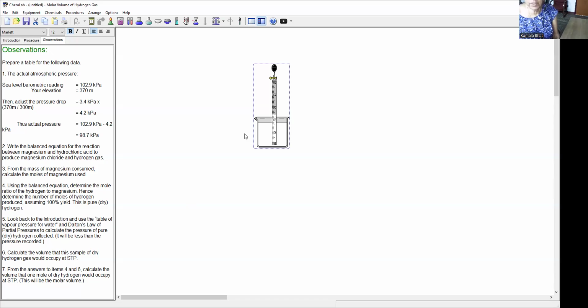Make sure to copy the picture of the experiment, initial and final, so that I can read the volume of the gas inside. Pressure is there, and complete it. And so complete the homework. Put your results, discussion, conclusion, homework, save everything and upload it into the correct Dropbox.